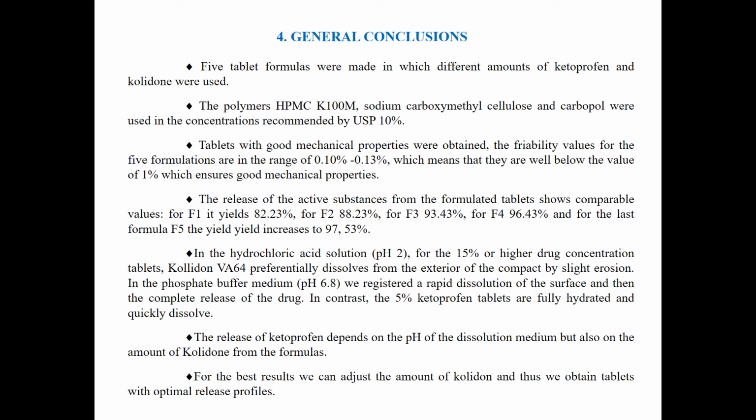In the hydrochloric acid solution, for the 15% or higher drug concentration tablets, the tablets preferentially dissolve from the exterior of the compact by slight erosion. In the phosphate buffer medium, we register the rapid dissolution of the surface and then the complete release of the drug.